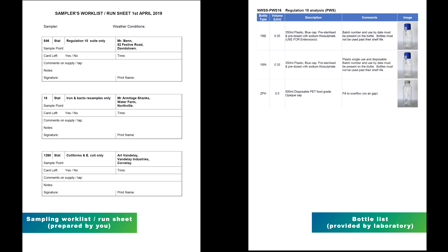Once chemistry sampling and tap disinfection are complete, you should next double check your sampler's work list to determine which microbiological determinants are required and which bottles you will need to fill. At this stage, it's also prudent to double check the bottle filling instructions supplied by your laboratory.